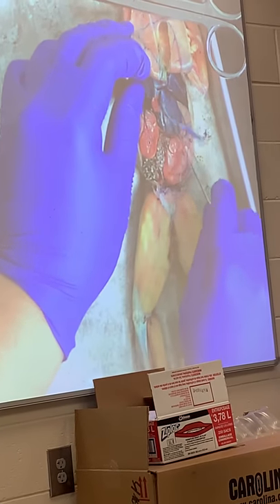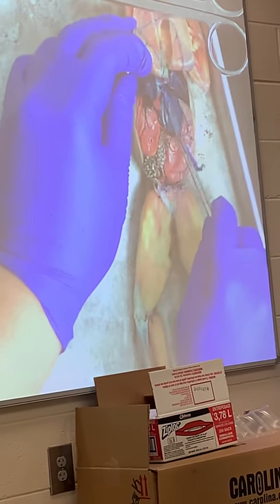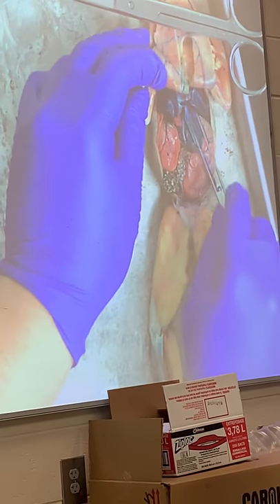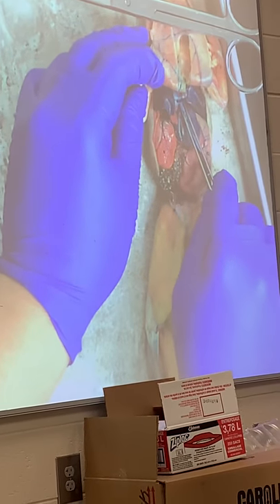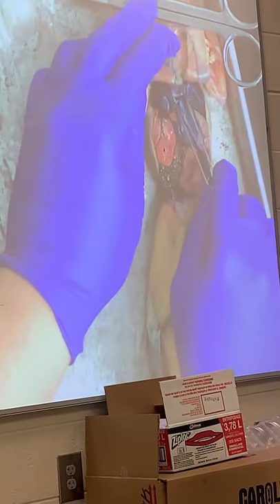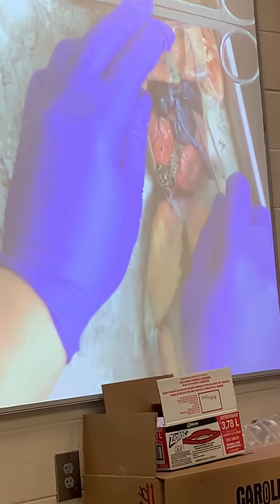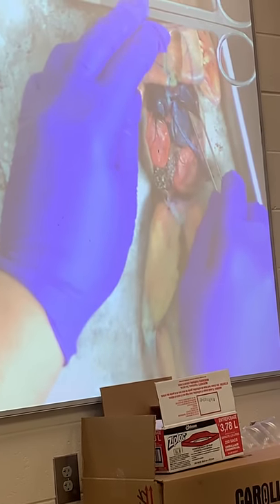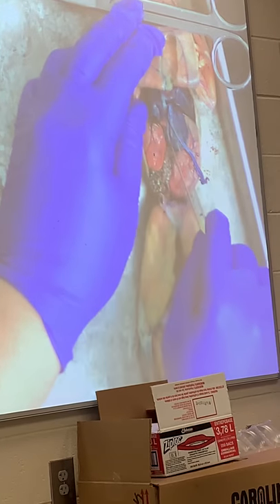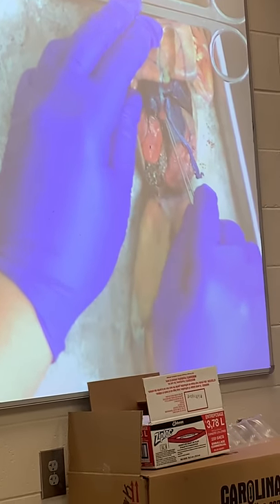Anterior to the gallbladder, we can see the area where the ventral abdominal vein enters the liver up here. So I have my heart, and then I have right lobe, medial lobe, and left lobe of the liver. Between the right lobe and the medial lobe, I find the gallbladder.